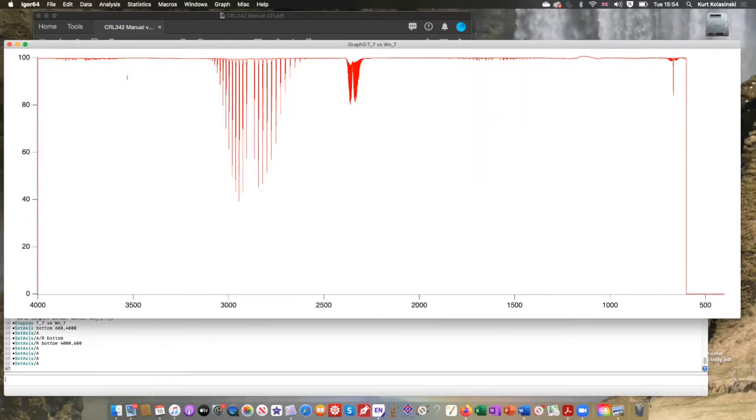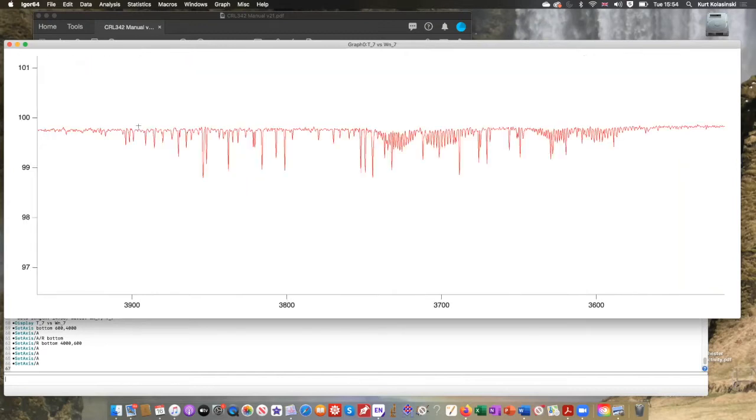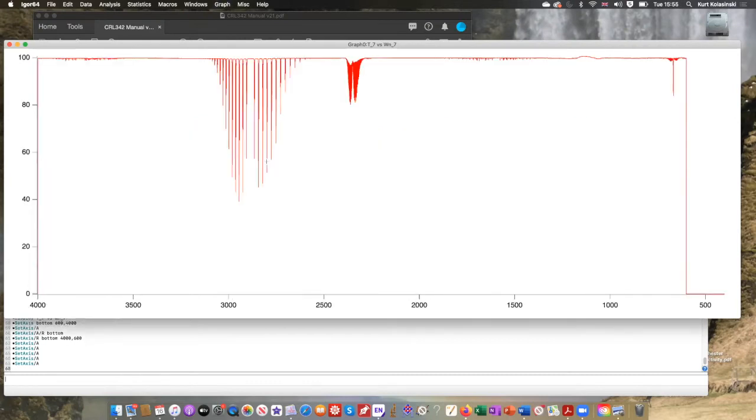Okay. And then again, if we go out here, some very small impurity peaks, right? Oh, wait a second. There's some very regular stuff. And then more very regular stuff, branch, maybe missing thing, another one, and these irregular lines. So what's this all coming from? Well, we had a couple of molecules that we were trying to get rid of, right? We didn't get rid of all of the water and CO2, all right? And they're both triatomic molecules, all right? CO2 is a linear triatomic molecule, and H2O is bent, right?